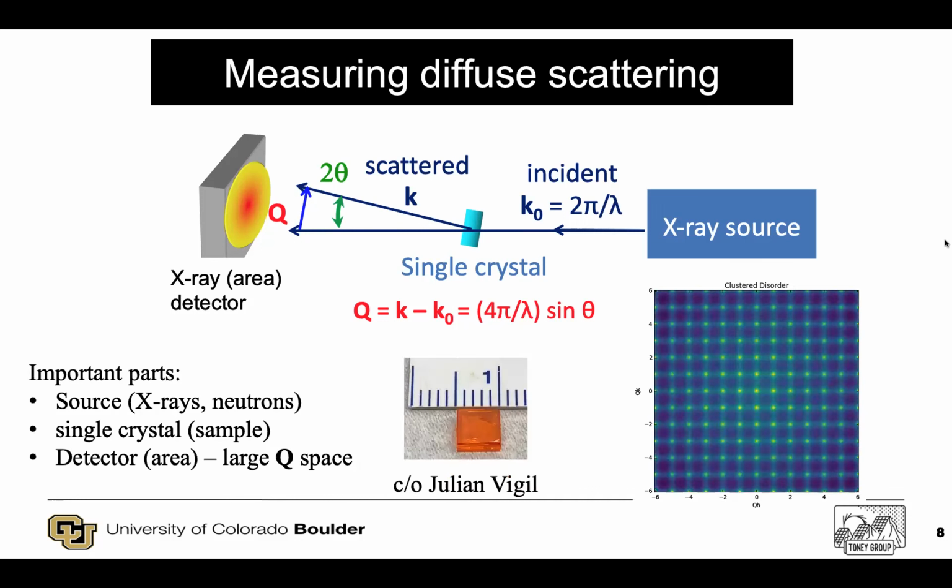I've done most of my career in terms of X-rays, and thinking about the brightness has improved dramatically. Similar things, although less significantly, apply for neutrons. And so that's really helped to enable our ability to measure the scattering.